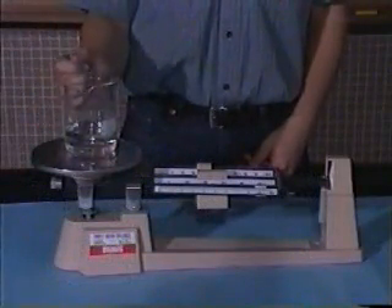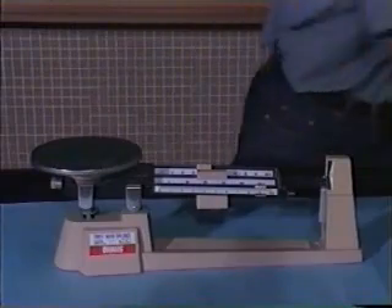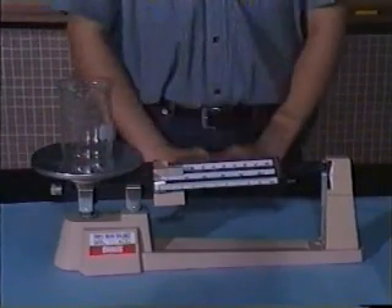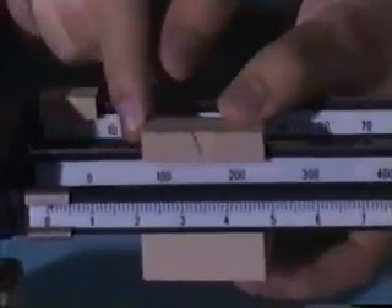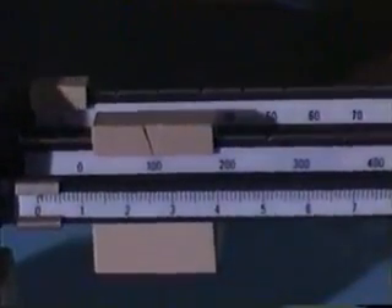Now we've just measured the mass of the water in the beaker. And if we want to measure the water only, what we do is remove the water. We now re-measure the mass of the beaker only this time. Place all the masses to the left and move the heaviest mass to the mark 100, then 200 — it's too heavy. So we move it backward to 100.